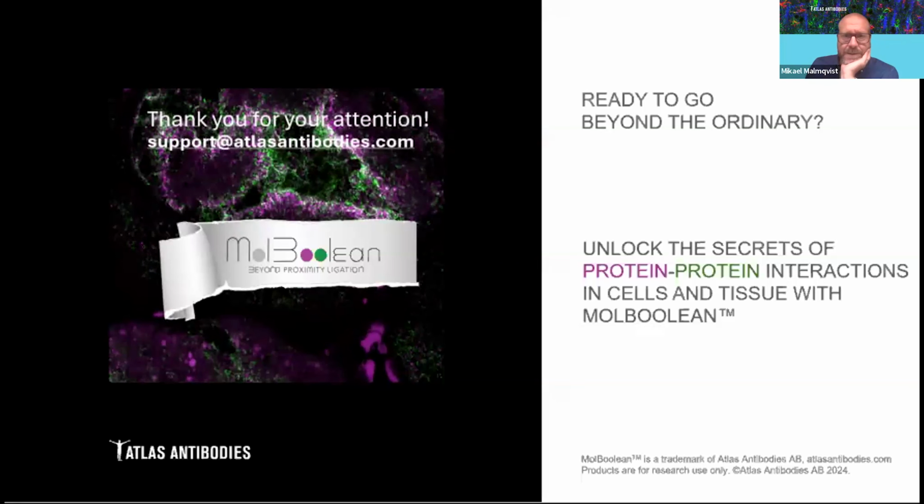Yes. Another question here: since customers use their own primary antibodies, do the oligo-conjugated probes function as secondary antibodies? And yes, the answer is yes to that one, right? It's the anti-mouse and anti-rabbit secondary antibodies, yes. Quick answer to that. What is the distance between the proteins that create the reaction?